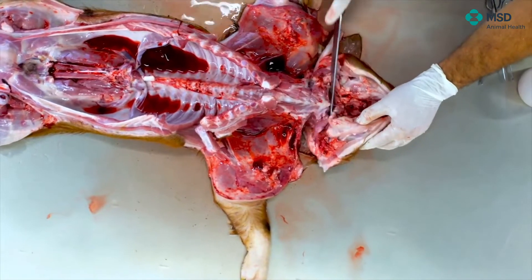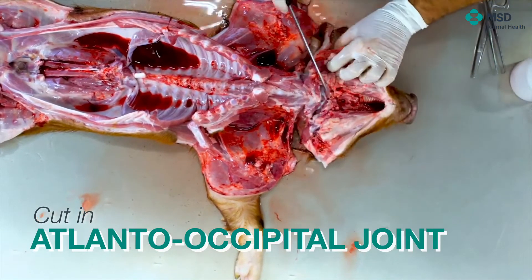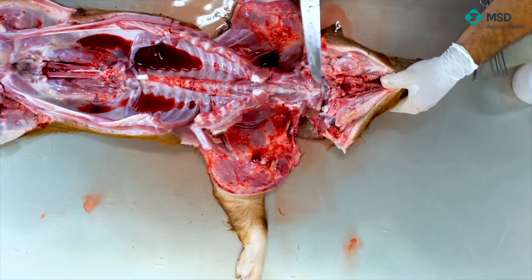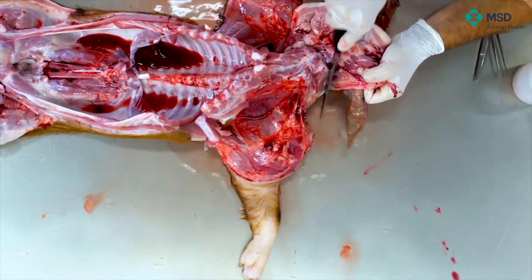And rapidly, I can see the point of the joint, which is just there — it's very clearly seen. Then what I need is to separate the muscles at that way.